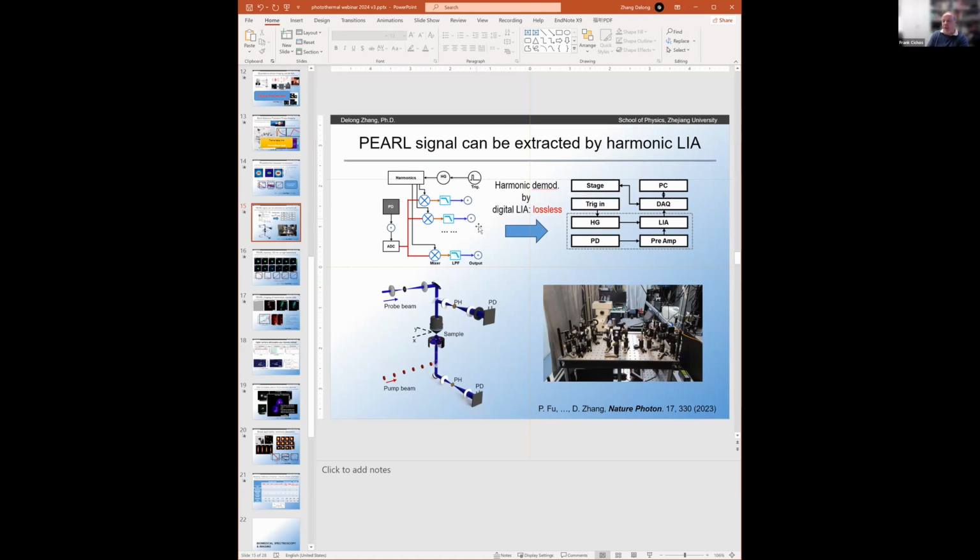That's why this digital locking is very important, because you use the same photodiode. It digitizes everything. Then you can simultaneously get from the first harmonic to any higher orders, limited by the signal to noise ratio. Oh, okay, my question was related otherwise, but most infrared lasers anyway come in a pulsed mode, and then you don't have the chance to really do a fundamental. Exactly, because of the heat dissipation. If you use sinusoidal, then it will just blur everything.